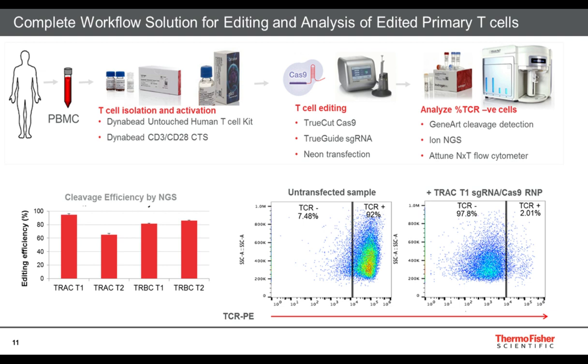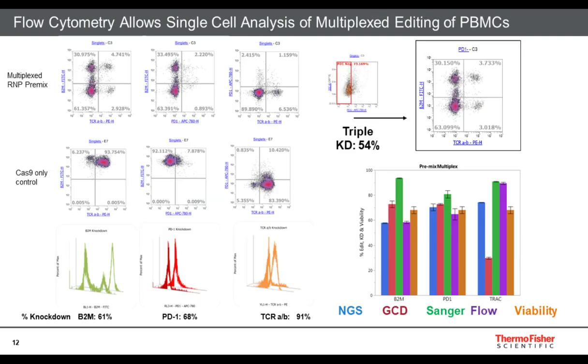And this is really the first step, kind of going back. One of the first steps of any genome editing experiment is to validate your guide RNA designs and pick the best one. And we rarely just design one guide RNA, right? Standard, most people choose about 3, right? And then decide to move forward with the best one from there. So in the case of using flow cytometry, you can have your answer in 48 hours and then know which is your most appropriate guide to move forward with very, very quickly.